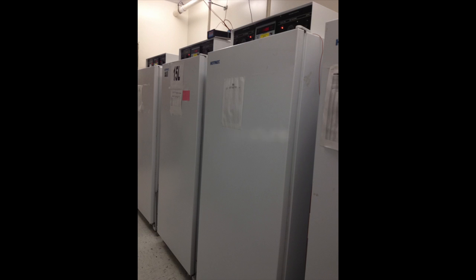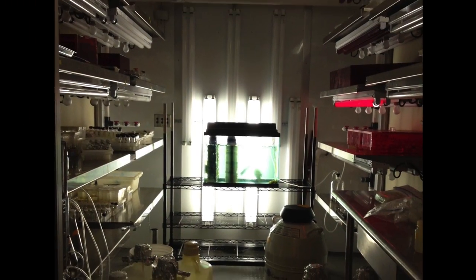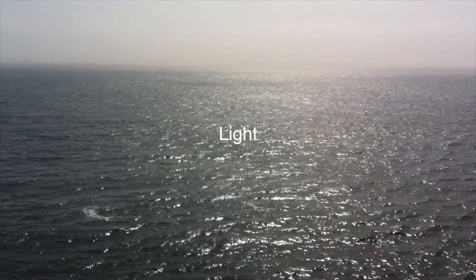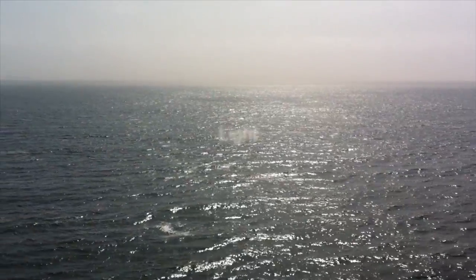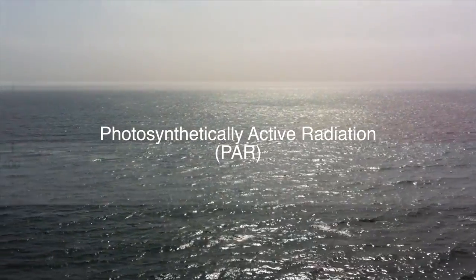Water temperature control is critical for seaweed culture. Culture systems can be controlled individually or placed inside larger temperature-controlled rooms or incubators. Algae, like other plants, utilize photosynthetically active radiation, or PAR, the portion of light available for photosynthesis.